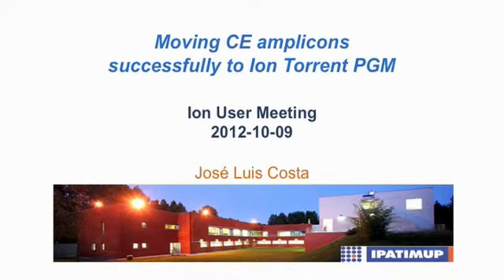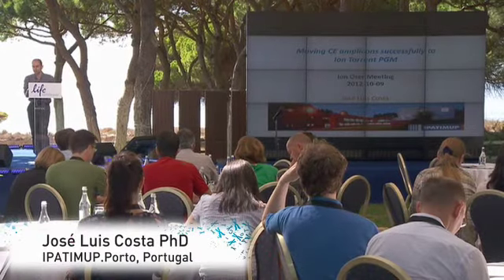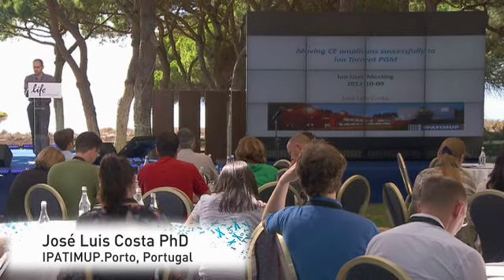It's really a pleasure to be here and to have this opportunity to share with you a little bit the story of our PGM in the lab. As you see from the title, what I will be talking to you about today is how we approached moving our gene panels from Sanger sequencing to the Ion Torrent PGM.